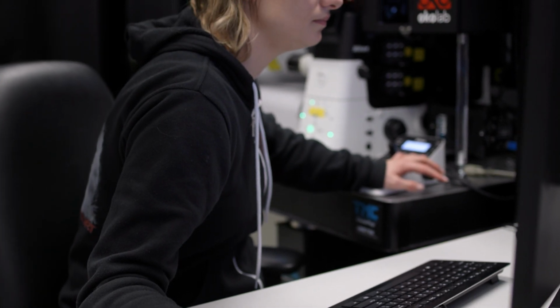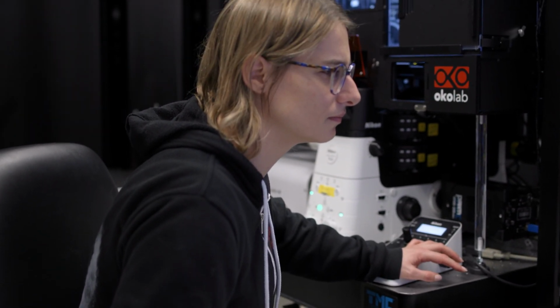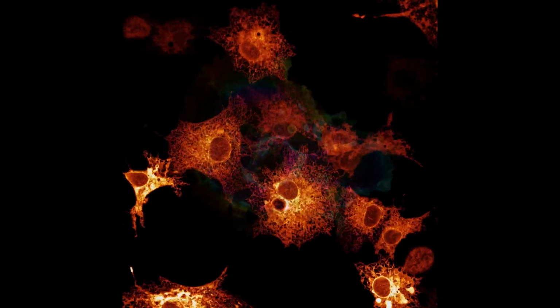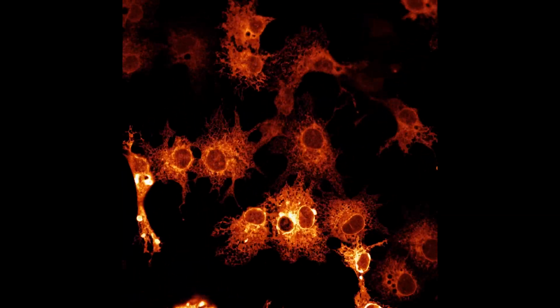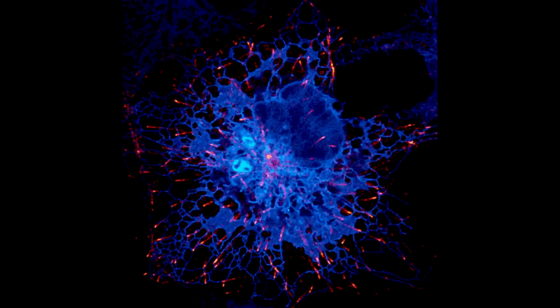So with modern technology, we can speed up that process very, very quickly. In fact, it is happening so fast that most biologists will be able to follow live biological processes as they are happening inside a moving organism while being able to capture all the volumetric data and continue to make a 3D movie of a biological sample as life is happening. And so that is how confocal microscopy works.